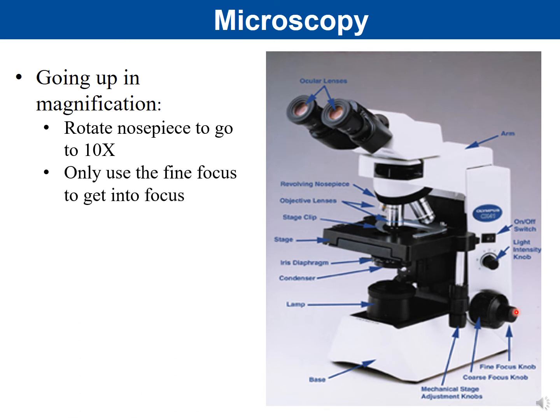When you do this, you only use the fine focus to fine-tune your image. You would not use your coarse focus. You would only use your fine focus. And you're going to see why in just a minute.